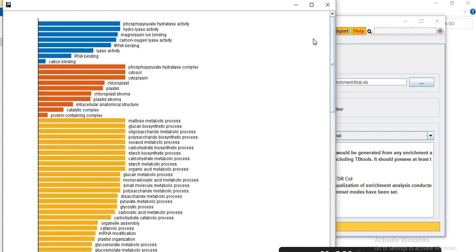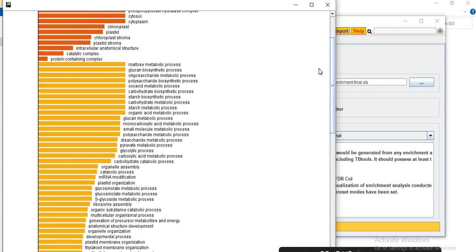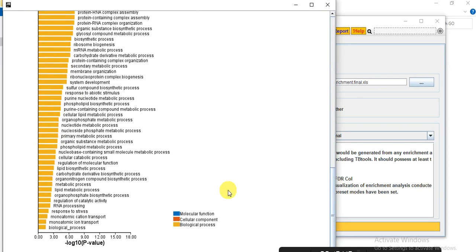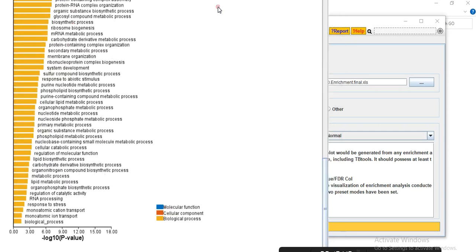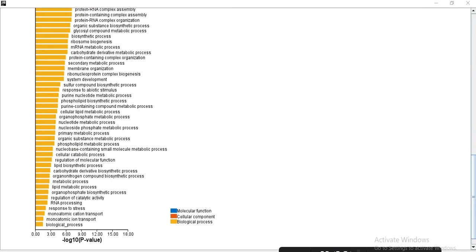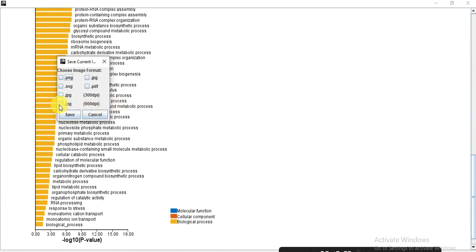This is the graph of your family genes showing which three functional classes they belong to. You can then save the graph — select JPG at 600 DPI or PDF format and save it to your destination folder. In this way you can do the gene ontology analysis of your RNA-seq data to find out your gene of interest's functional category through the TV tool. It is an easy way to do your gene ontology analysis.